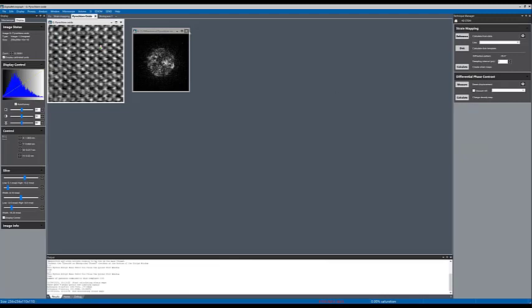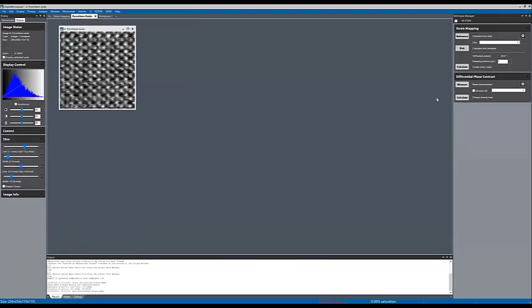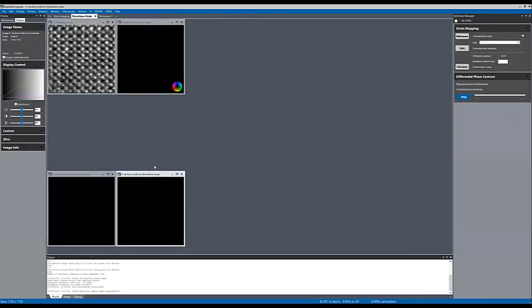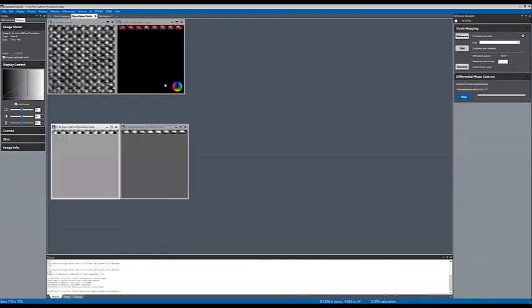Okay, so it's really simple. Once you have your data set, you click on measure beam displacement. And so it is now calculating the X and Y in the diffraction direction maps, center of mass movement in X and Y directions.